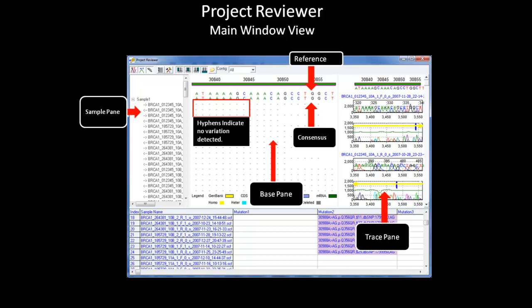We will discuss how to adjust the pane to display different electropherograms later on. The mutation table resembles the mutation table in the main analysis window, as it displays similar information. You can also double-click on the mutation, and the project reviewer will take you to the sample that contains the mutation, the mutation in the base pane, and the location of the electropherogram, since the whole reviewer is linked.